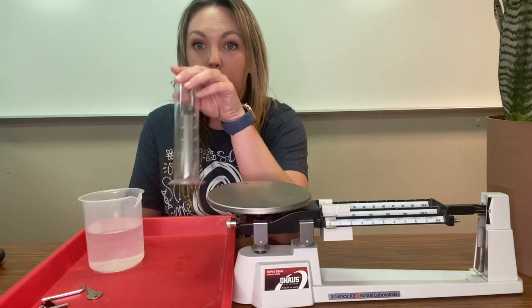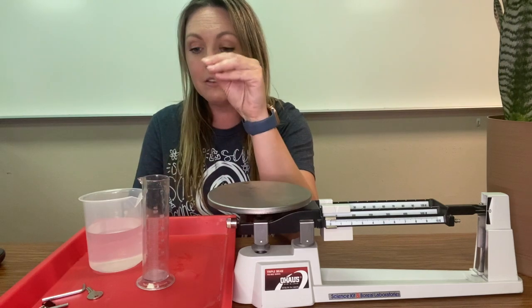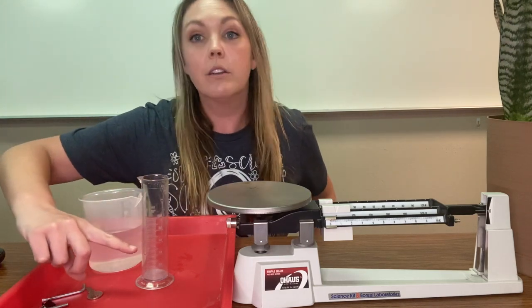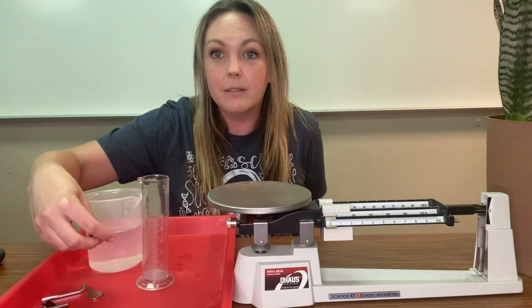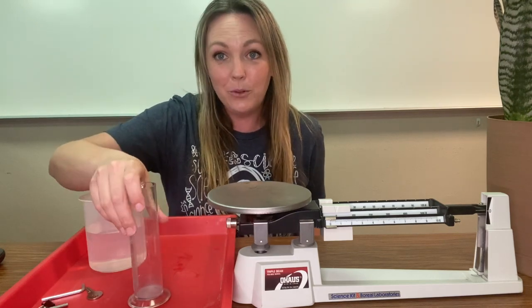This here is a graduated cylinder and this is used to measure volume. Specifically, it is used to measure volume displacement. That happens when there is water in here originally, then you place an item in and subtract the difference between the new volume of the water and the old volume of the water.